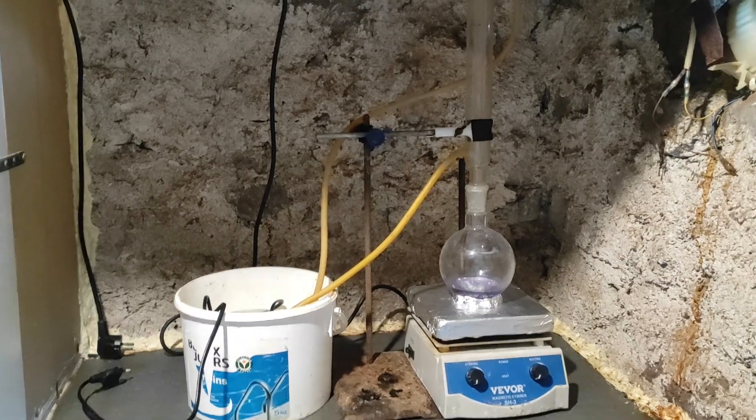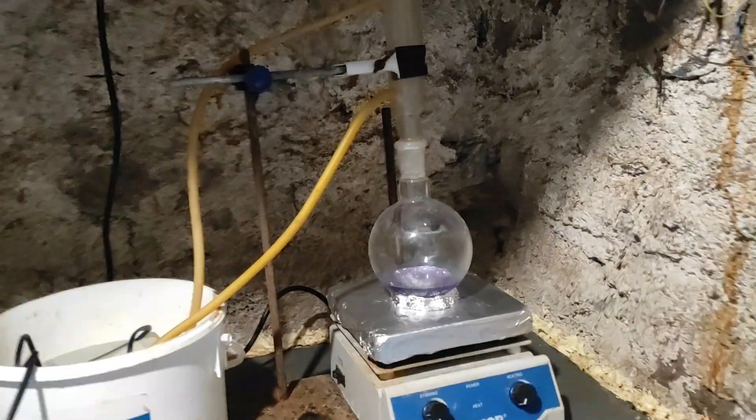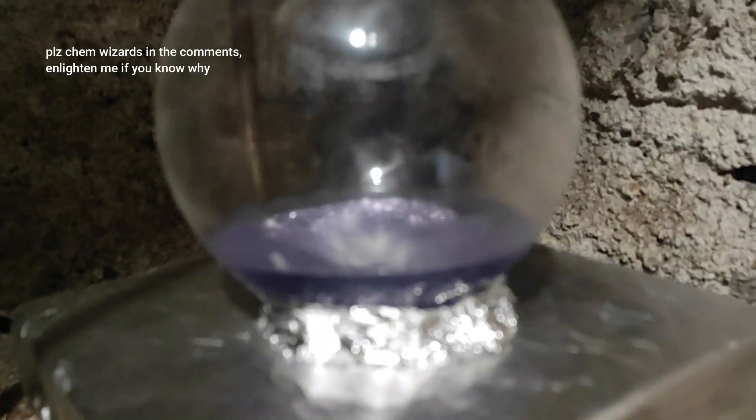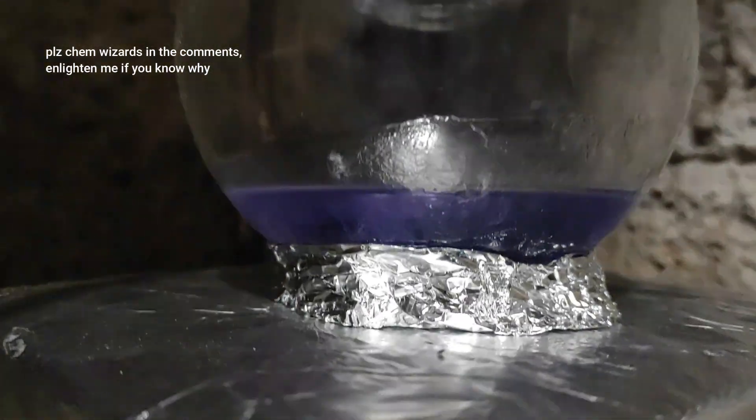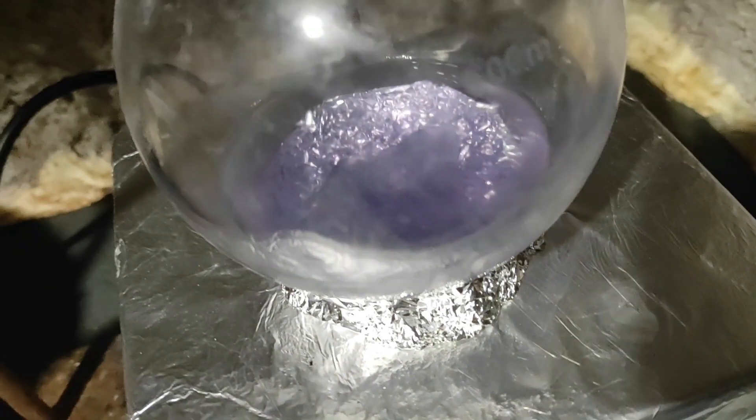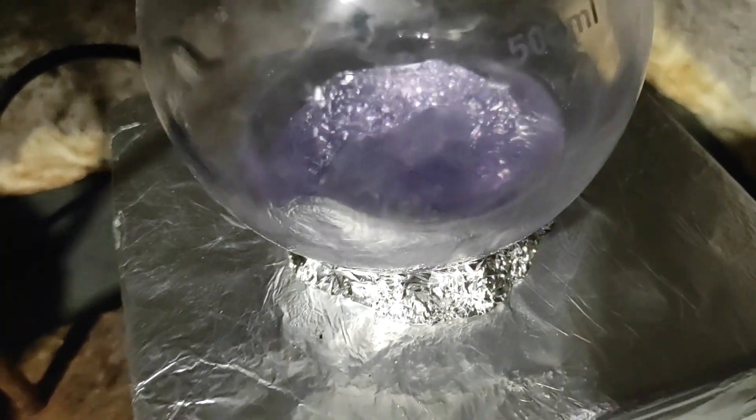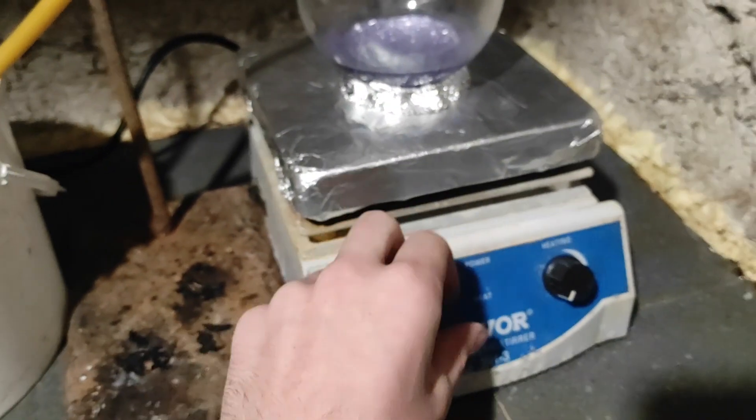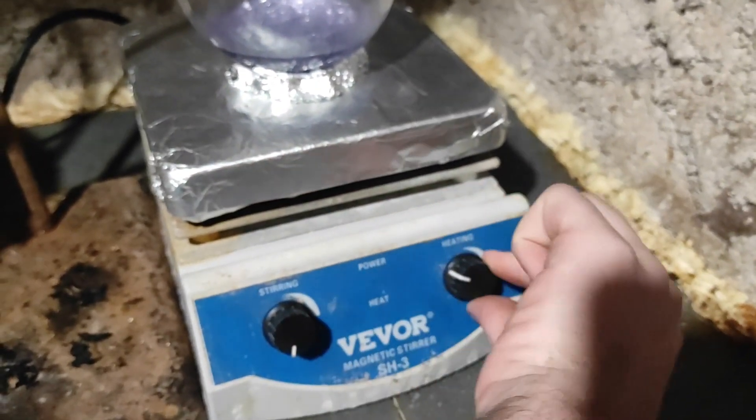When all the acid has been added the flask has now turned this weird blue purple color for some reason. Anyway I added a condenser on top of the flask to make a reflux apparatus. This will allow for the methanol solution to be boiling constantly without losing any methanol because it gets recondensed in the tube and drops in the flask again.